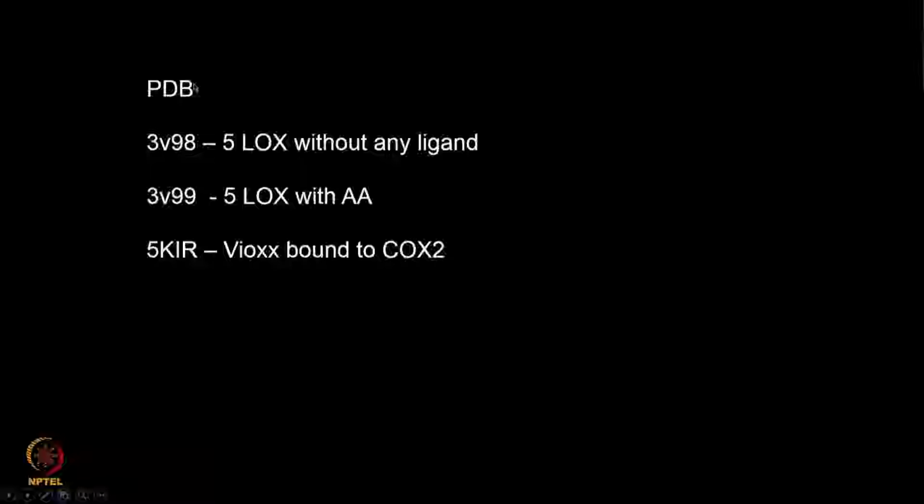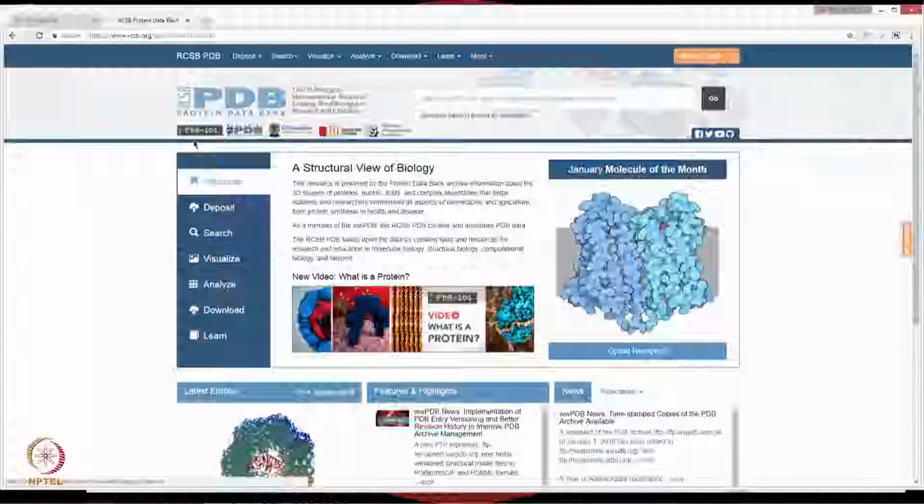We will continue on the topic of target based drug design, related to docking. Let us again look at the Protein Data Bank, that is called PDB, which contains the 3-dimensional structure of a large number of proteins. We also have ligands present in some cases, and in some cases ligands are not present. So, we will have a look at that. This is the PDB, the Protein Data Bank.